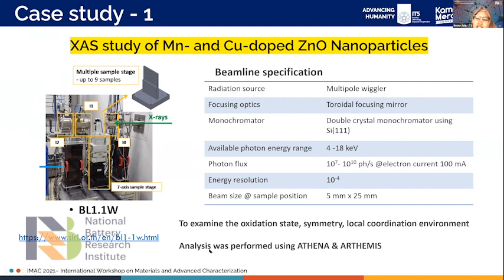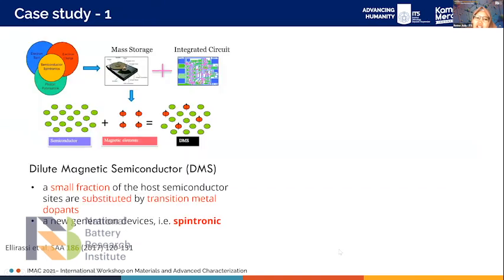And here we did the analysis of the spectra using Athena and Artemis. And I guess Bruce Ravel also gave a lecture on how to do the analysis in these two software, so you can find it easily on the internet.